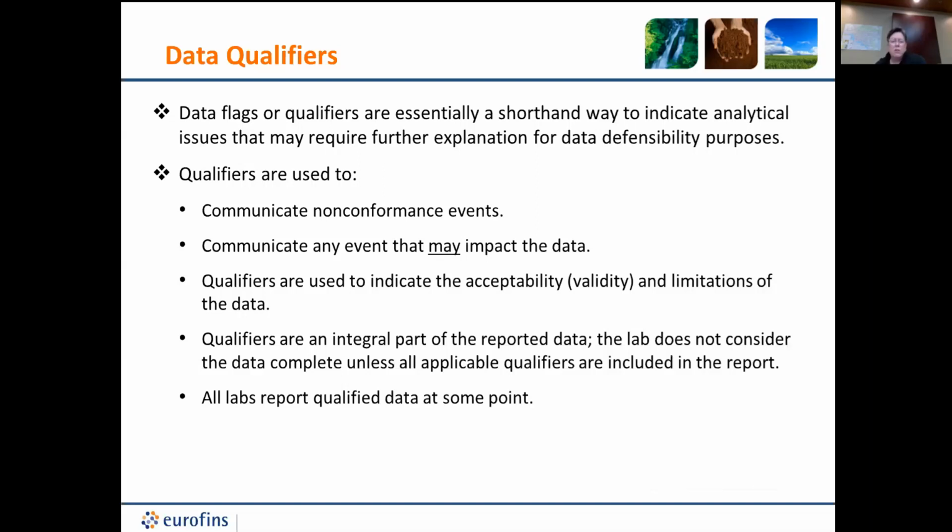And a lot of these questions come up, and those are the types of questions that are great for a project manager to help you work through, or a lab's quality assurance team, or even myself here at Calscience Irvine. Just know that all labs report qualified data at some point. Just because you see a qualifier doesn't mean your data is bad. It's just saying, hey, take a look at what's going on here.